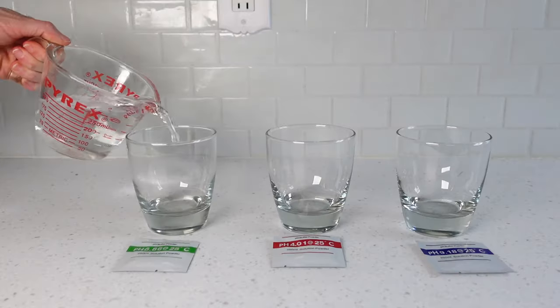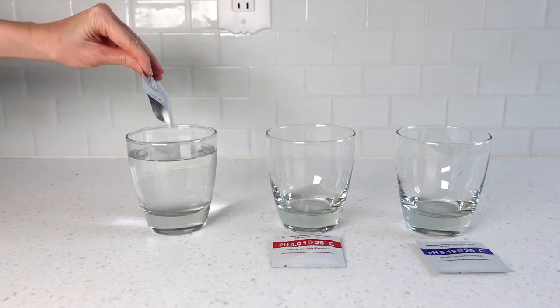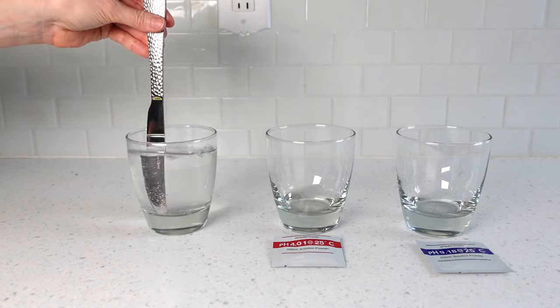Let's pour this water into the glass. The first buffering packet will be the green 6.86. Empty the powder into the glass, then stir completely until it's fully dissolved. This can take a minute or two, so have patience.